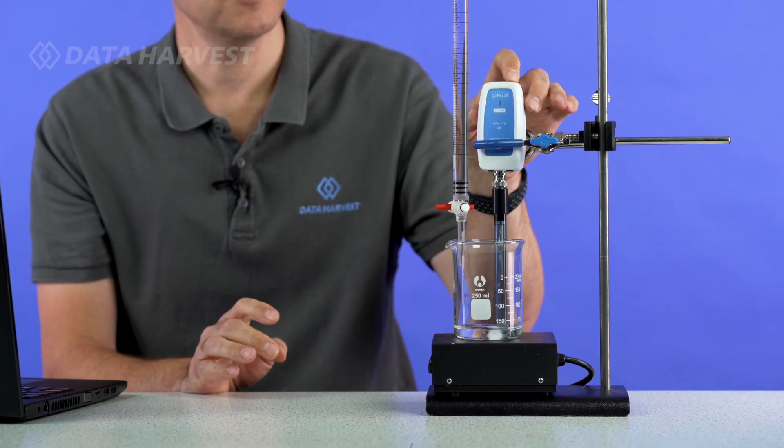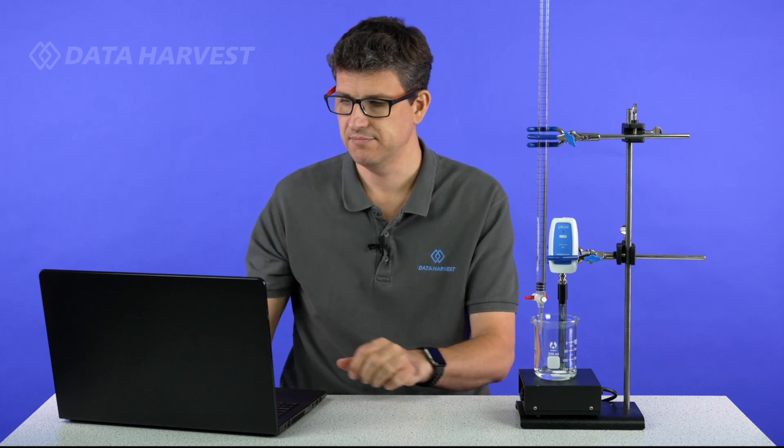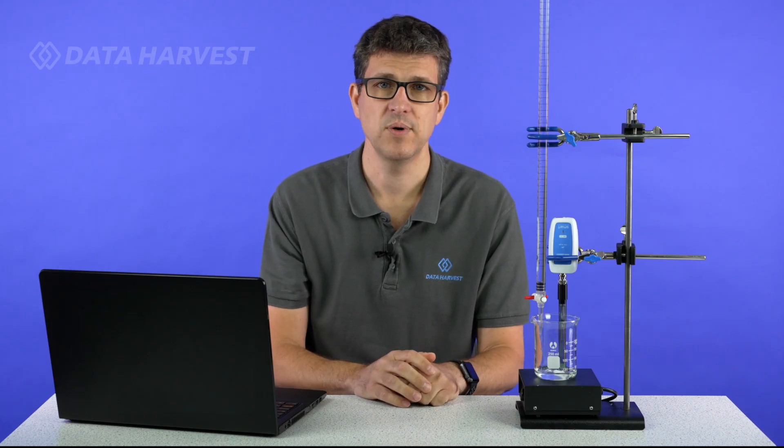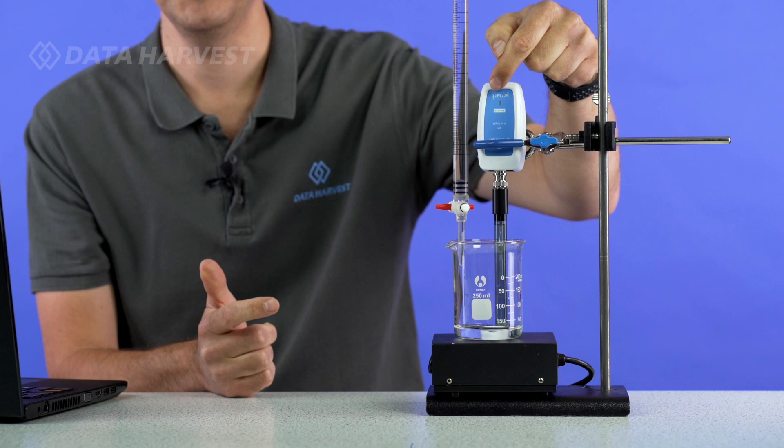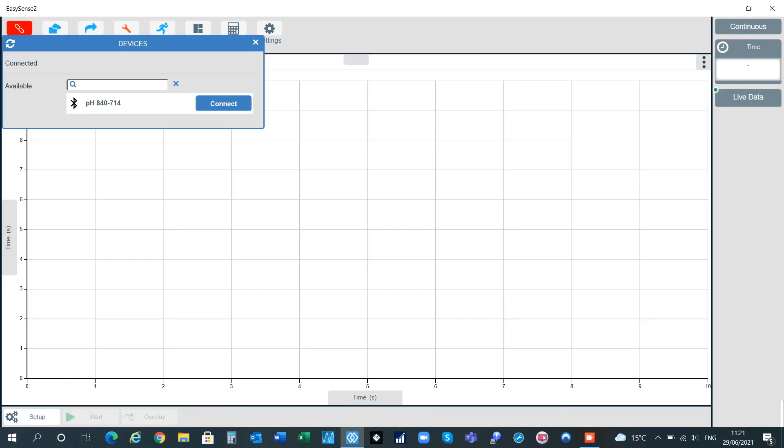To start off with we want to connect the software to the sensor. You hold the button down for two seconds, the light has now come on and it's now flashing. We now go and open the EasySense2 software. The really good thing with the EasySense2 software, I'm going to ask it to search for Bluetooth devices but it will only pick up Data Harvest Bluetooth devices. I'm going to click on device on the top left hand side. It now picks up pH. If you've got multiple pH sensors in the lab, on the front here you've got the light flashing, and there's a unique ID number to each of the pH electrode sensors. I can now click the one finishing 714 which is what it says on the front. I now connect, takes a couple of seconds, it will connect to it.